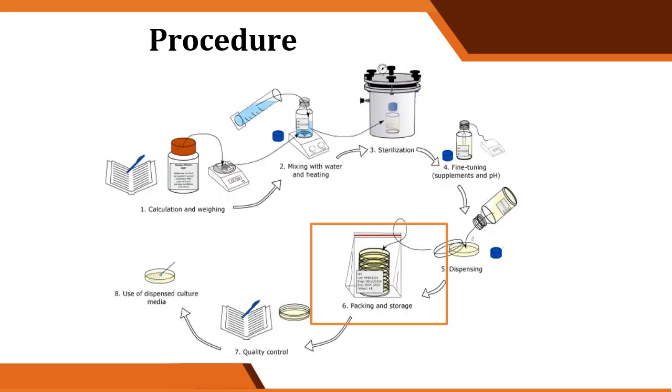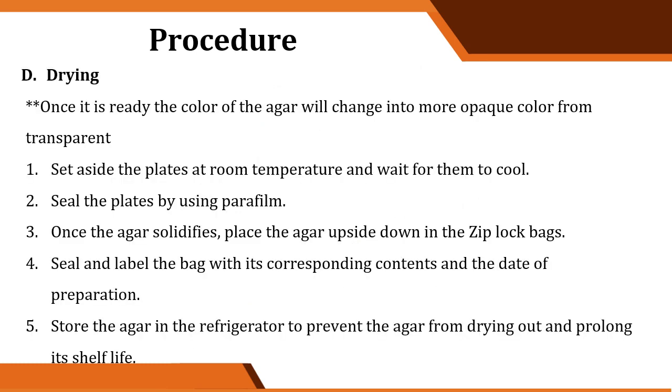Next is packing and storage. Okay, so yun yung purpose ng Ziploc. Okay. So once the agar is dry, malamig na. Okay. Yan. Set the plates at room temperature and wait for them to cool. And then, seal the plates by using parafilm.